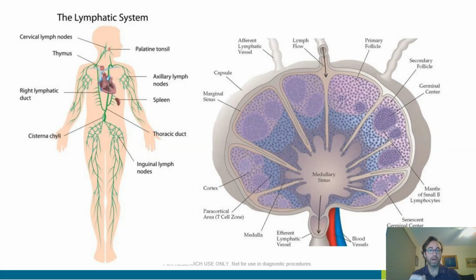So when we think about how to study this tissue, we recognize that there's a couple different components that we need to understand the actual functions that are being performed here, as well as how cells mature. The first is that this organ is composed of both key cell types that are going to be moving throughout the tissue, as well as different structures that are important to focus on, and that you can only really retain if you're doing an approach that is spatially resolved.